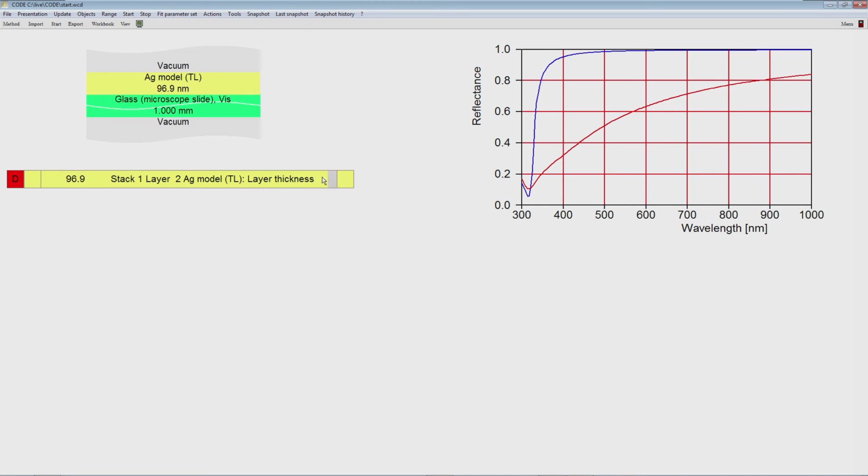And as you can see, 100 is too much for this, at least. We can check it manually. This would be something which is correct. So we can press the start, we can fit this automatically. Very nice fit. Seems to work almost perfectly. So we are lucky with this model.